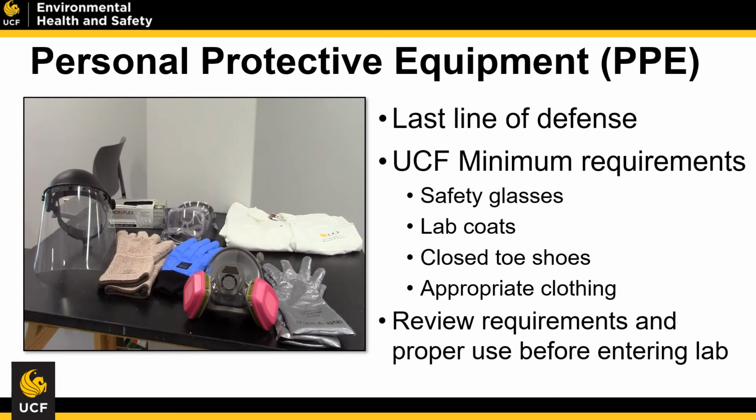For gloves, there are different types of gloves. Some are nitrile, some are latex, some are silver shield. Different gloves have different exposure times and different limits on what they can be exposed to. There are many references out there, but if you need reference material, please reach out to the Environmental Health and Safety Department, and we'll be glad to assist you with selecting the right type of glove for the right type of use. One thing I will point out at this point is latex gloves may not be a good option for you because some people have an allergic reaction to the powder that's involved with the latex.